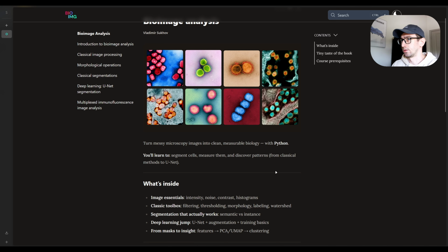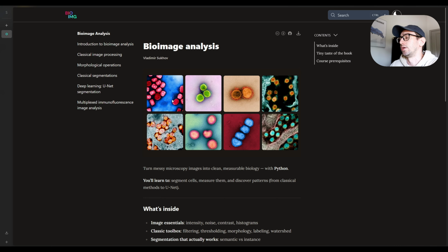of particular things. In cell segmentation, the task is, for example, you have an image and the idea is to identify particular individual cells. Here are just some nice examples that I found of how they look. The idea is to identify particular cells and assign a mask to each cell. In this course, we will try to get to the point where we can write our own simple script that can take the image, perform cell segmentation, and measure different features for us.